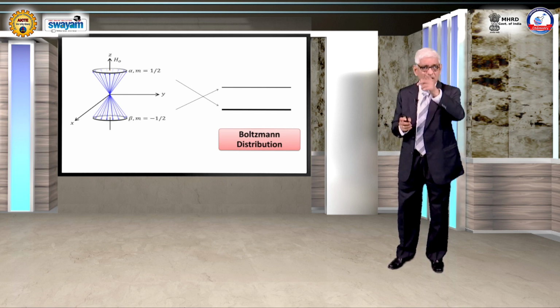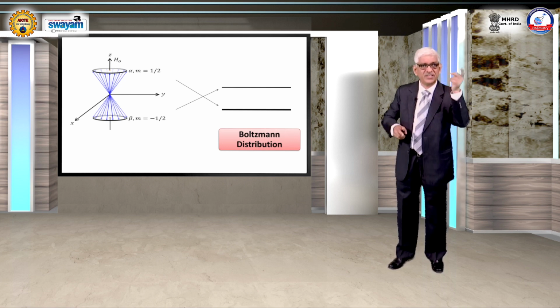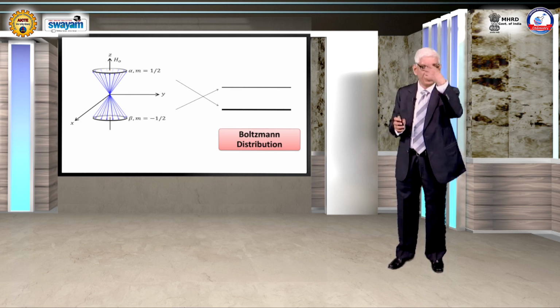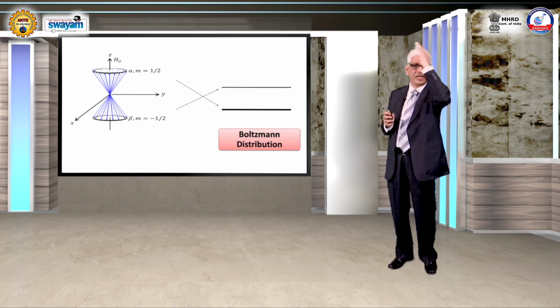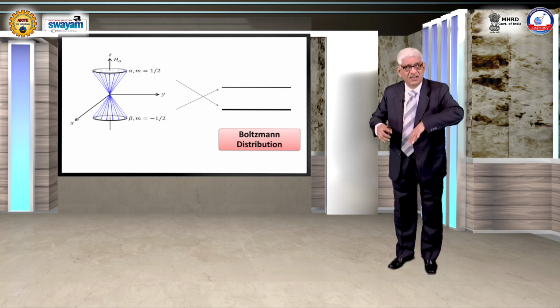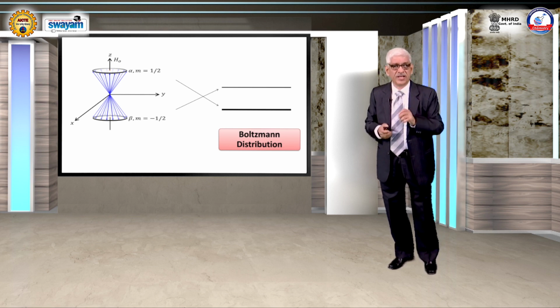They will spin around the axis of the magnetic field in a particular fashion, and this is called Larmor precession. All of these spins will distribute themselves at different places on the surface of the cone. The ones on the top will all be going like this, the ones in the bottom will all be going like this, and therefore you will have the complete cone covered by these nuclear spins.